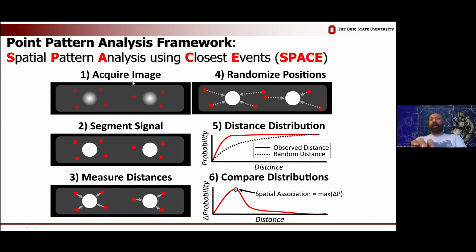So we instead opted for a point pattern analysis-based paradigm, where we segmented these signals, measured their distances to the nearest nuclear pixel, and then looked at the cumulative distribution function of those distances, comparing the observed distribution against what we would predict if the signals were completely randomized in space. And of course, all this analysis is done in 3D because that's what our data is, but I'll show you everything in 2D for ease of visualization.